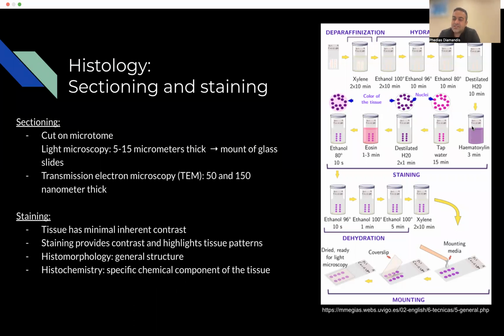And then once it's in an aqueous state, we can stain it with hematoxylin. As you can see here, we have staining of certain components. Usually, as we'll see, it stains the nuclei, but it will stain most of the tissue with some level of purpleness. There's different things you can do.